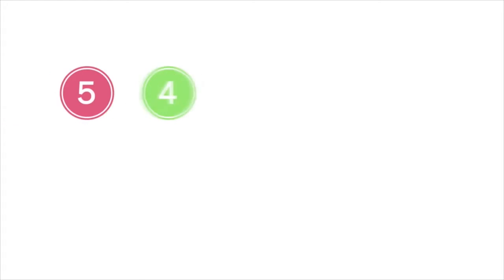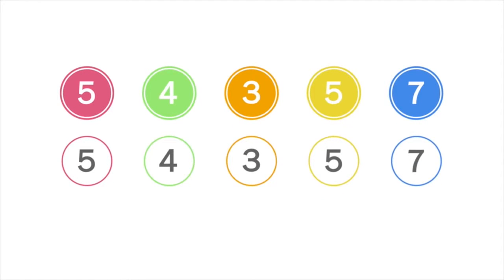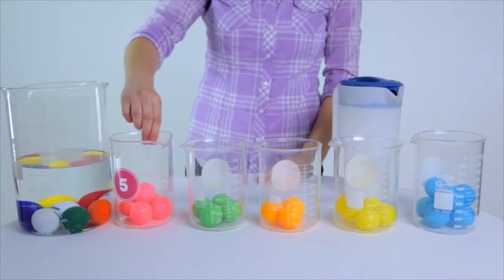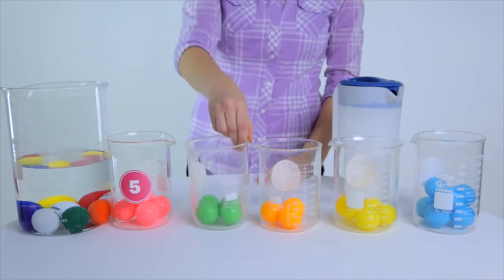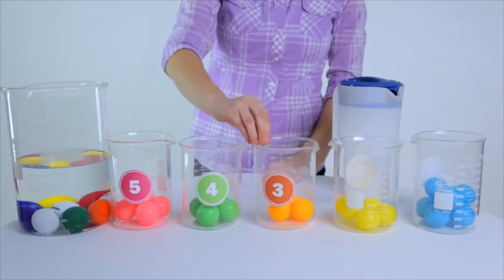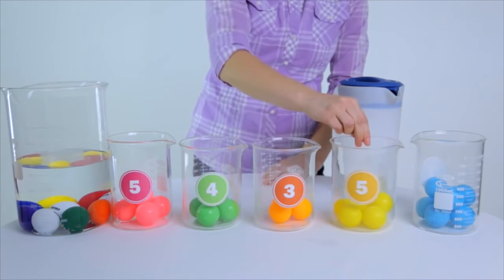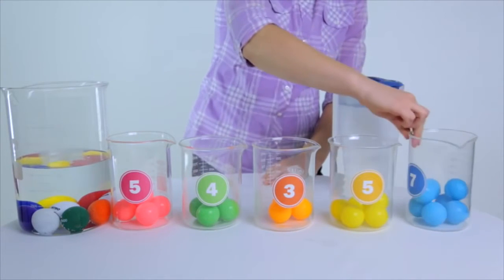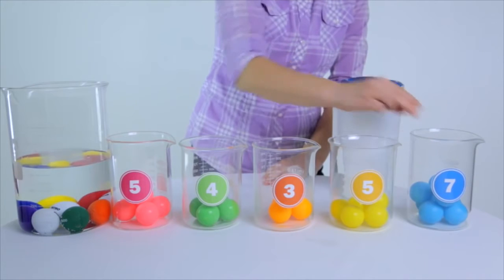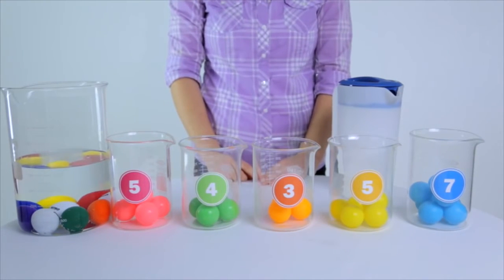In order to ensure therapeutic value, the essential oil must have a chemical profile that matches a known standard of other high-quality essential oils. In this demonstration, this standard is represented by the numbers on the sides of the beakers. If the amount of constituents collected matches the amount of constituents expected, the essential oil has the proper chemical profile to ensure a consistent therapeutic effect. This batch would be accepted.